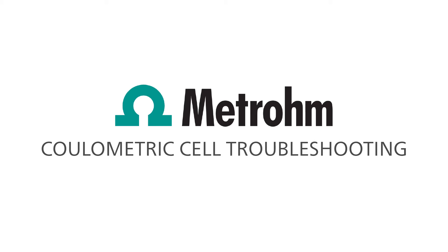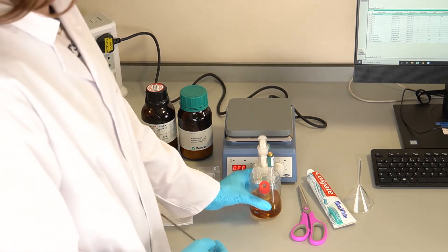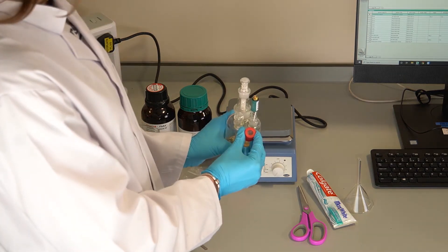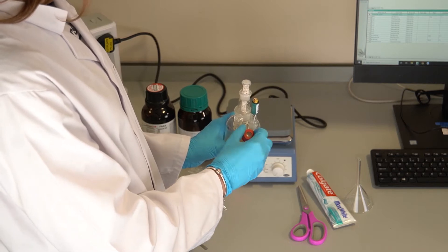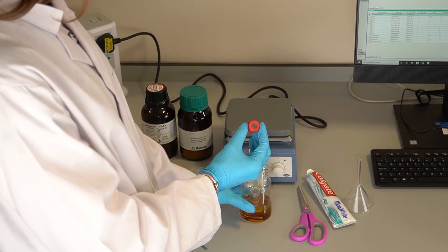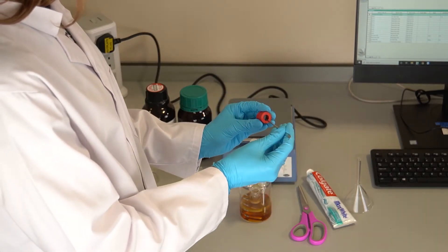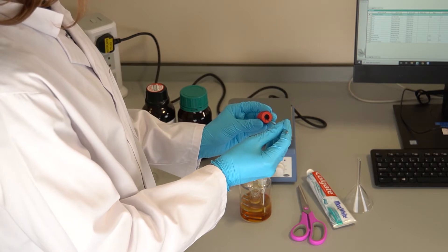Should there be any issues with the cell not conditioning down, or if the cell or electrodes are suspected to be contaminated, then we advise the following steps. Ensure the septum is dry and not torn, and replace if necessary.